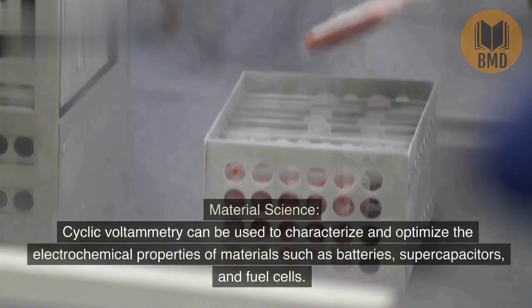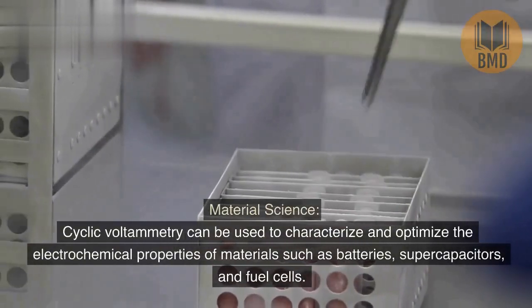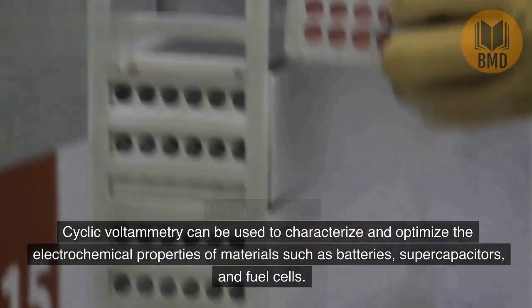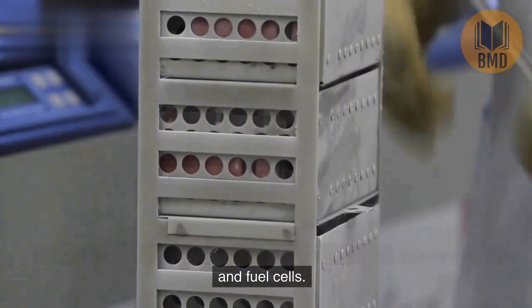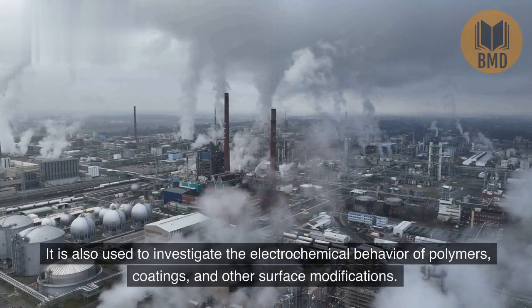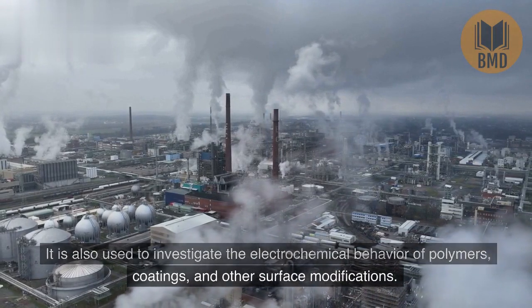Material science. Cyclic voltammetry can be used to characterize and optimize the electrochemical properties of materials such as batteries, supercapacitors, and fuel cells. It is also used to investigate the electrochemical behavior of polymers, coatings, and other surface modifications.